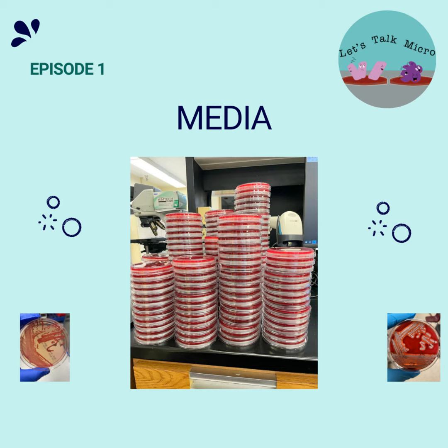Make sure that at this point, the space is not as crowded as in the first quadrant. And you repeat the same process twice. The goal of this is that at the end, you have some nice isolated colonies. And why do we need that? You have to keep in mind that our body's full of bacteria. You can have infections with multiple organisms. So if you don't achieve isolation, it's hard to get that organism by itself, so you can do a proper ID. You can run susceptibilities on it.